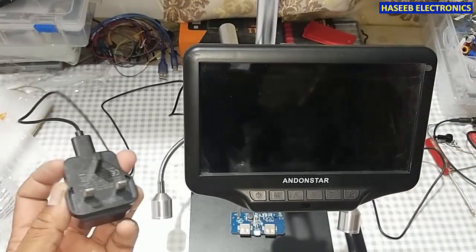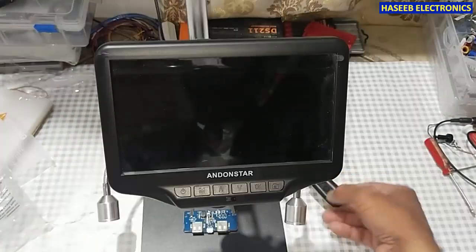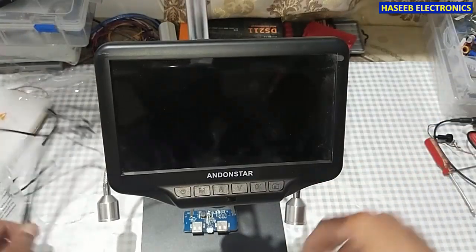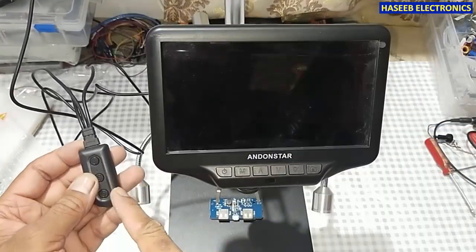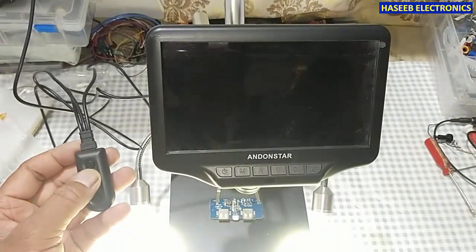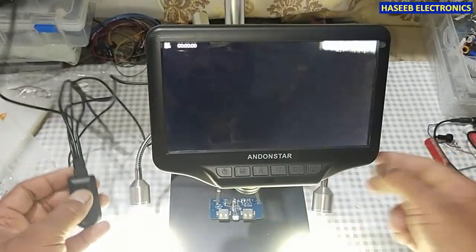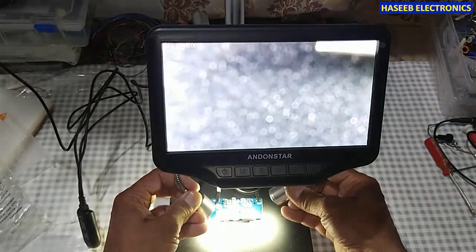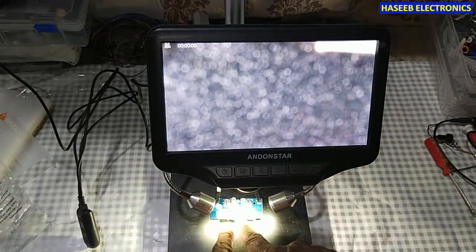Now I will connect the power plug to the power socket. I connected power to this power control module — here is the power on/off button. When I press it, it will turn on the display. Now we have two LED lights which will be used to illuminate the object.